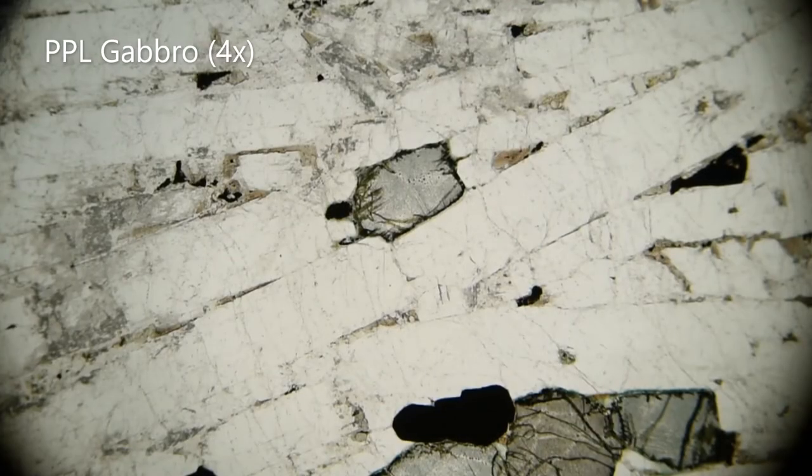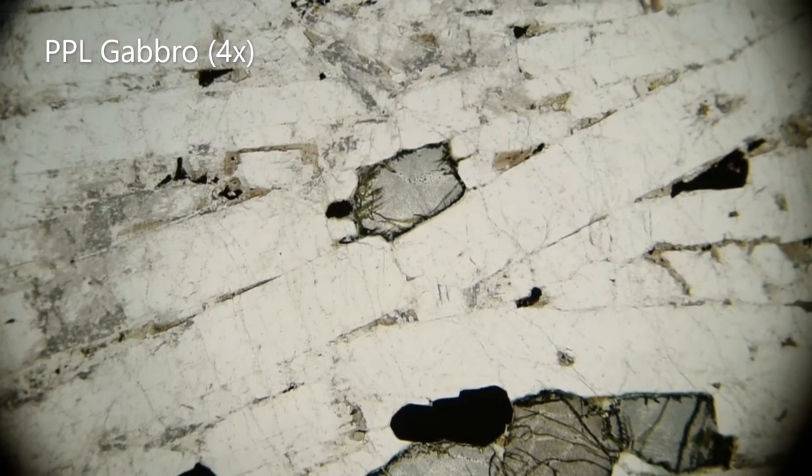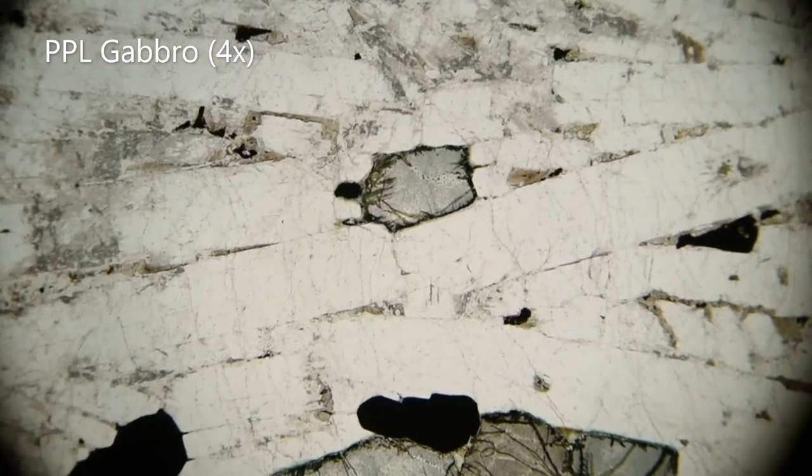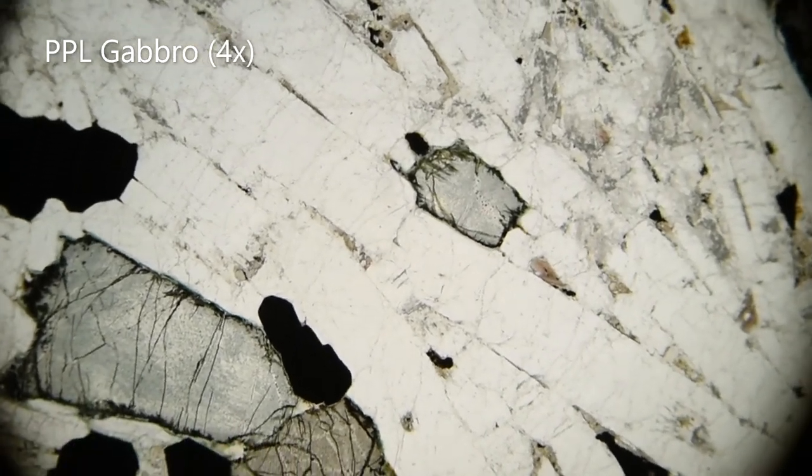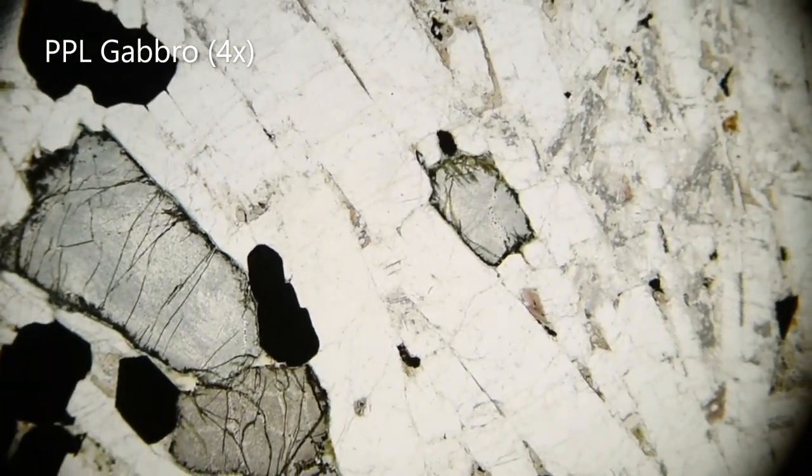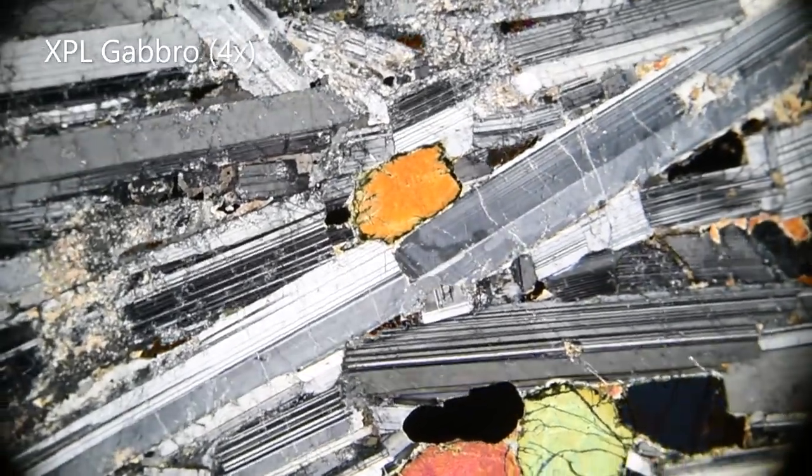This is an igneous rock called a gabbro. When we talk about relief, we look at how minerals stand out from one another. For example, the gray mineral, which is called olivine, has a high relief compared to the pale minerals around it, which are called feldspar.